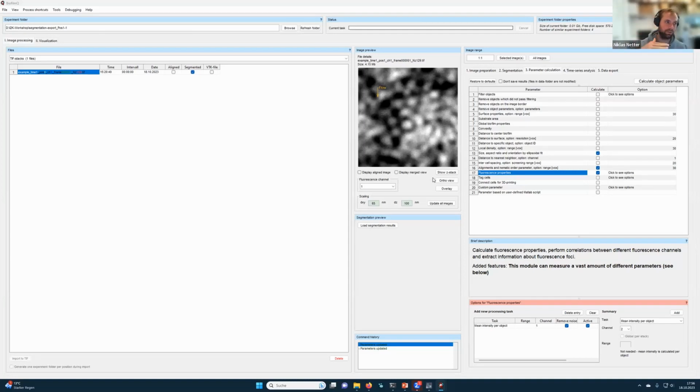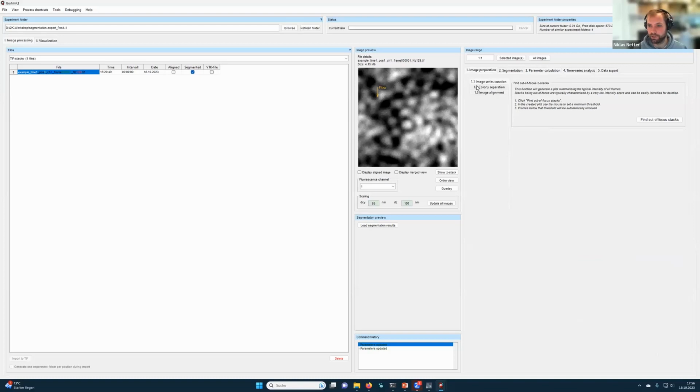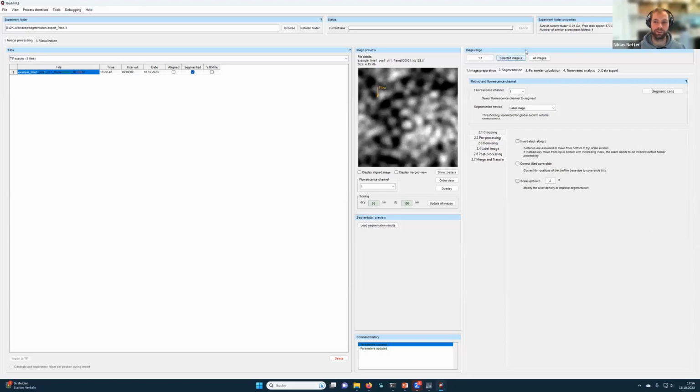Sometimes your image from above, in the Z direction, is inverted, so the bottom of the biofilm is at the highest Z. In segmentation pre-processing, you can select invert stack along Z. This inverts the directionality of the Z-axis, and therefore you can then have the distance to surface, or the surface of your biofilm, at the top of the Z stack. Does this answer your question?